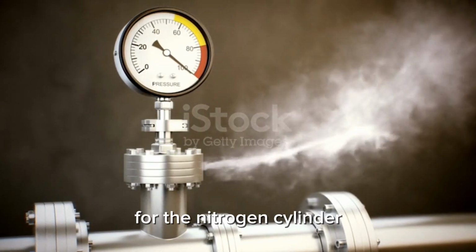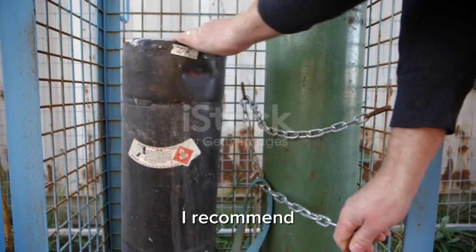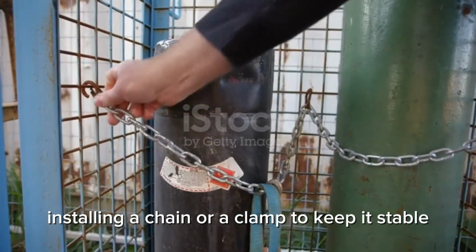For the nitrogen cylinder, I think engineering control is the best solution. I recommend installing a chain or a clamp to keep it stable.